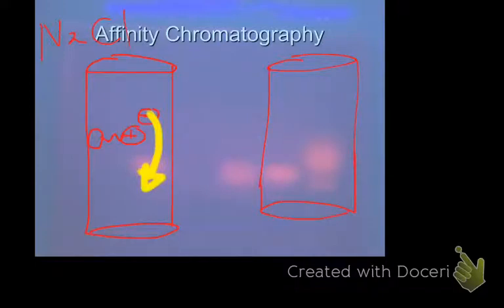Okay. So then we have the opposite. This one was the anion exchanger. Like I said, usually it's some type of amine, since amines are bases that typically are positively charged. This one has a negative ion at the end. And so what kind of proteins are going to want to bind to it? The ones that are more positive. So it binds. Now we bound our proteins to it. The other stuff is off. The ones that were more negatively charged or neutral would go through.